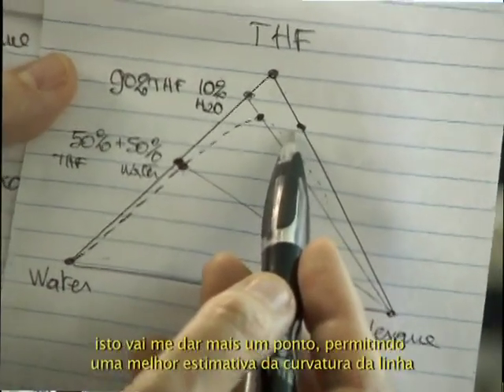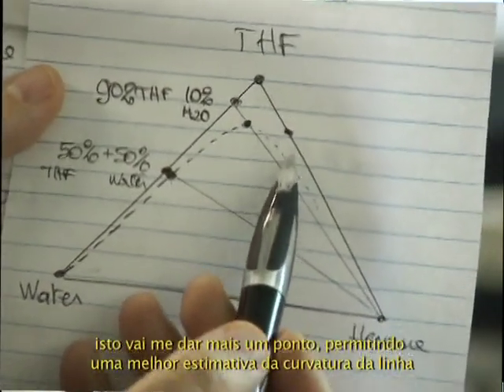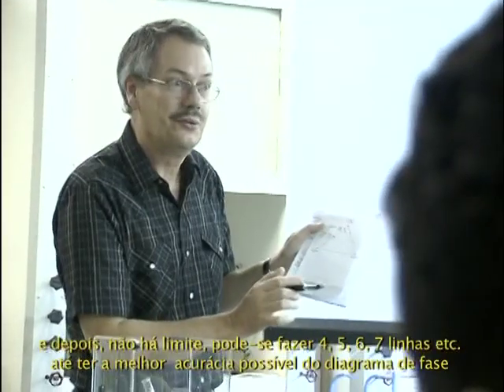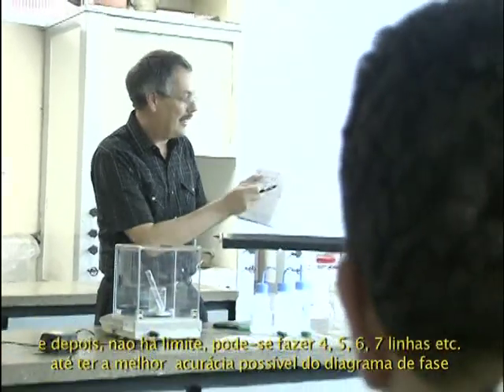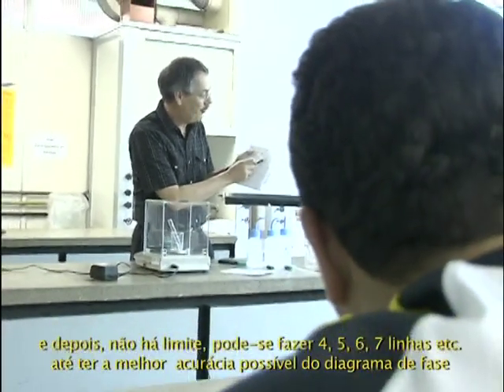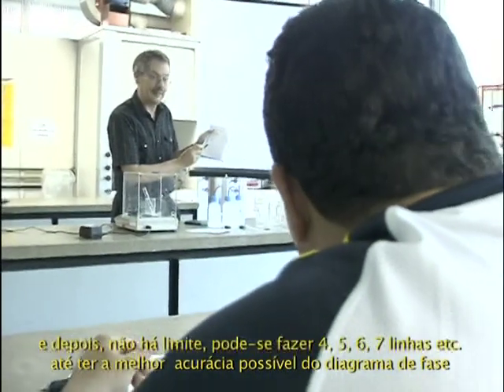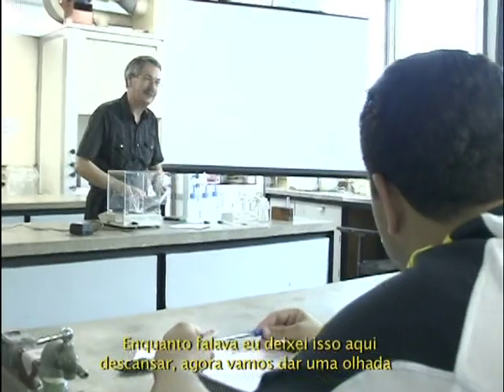That will give me one more point, allowing a better curvature estimation of the line. And then there is no limit. You can do 4, 5, 6, 7 lines to have the most accuracy possible on the phase diagram. When I was talking, we let this one rest.